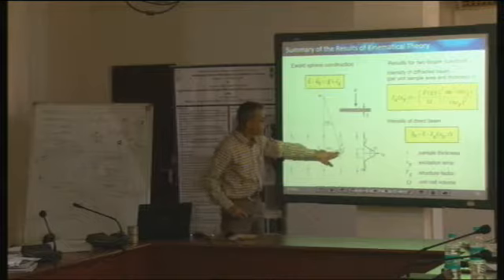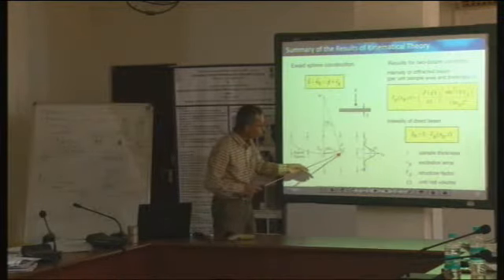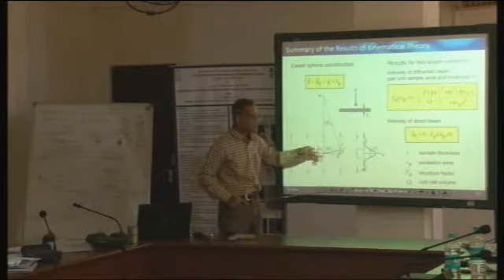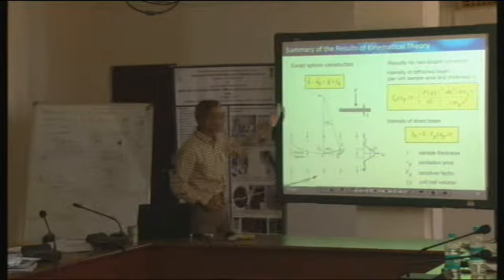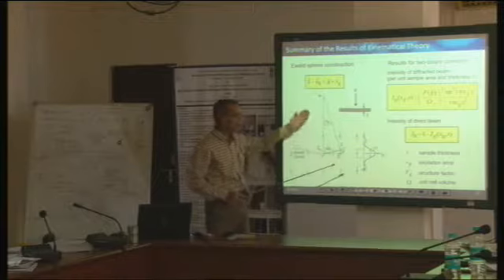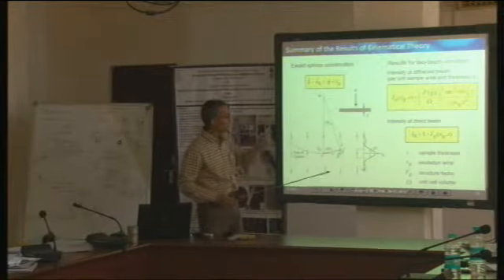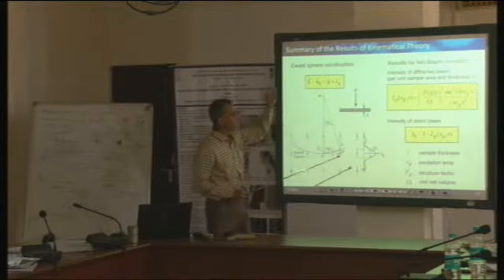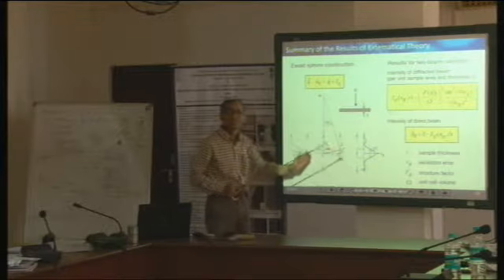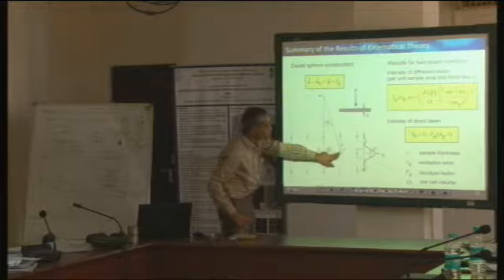Okay. But from the ideal diffraction condition, I am off by this much distance. This is denoted by S. Now suppose I change either my incident beam or my reciprocal lattice. You can do it both ways. We will think as if we are changing the orientation of the Ewald sphere itself. So right now this is the magnitude of S.